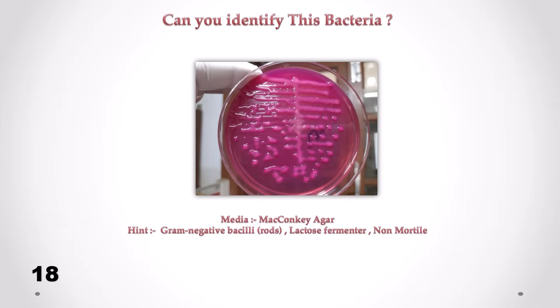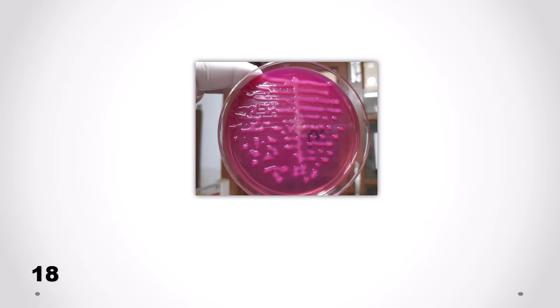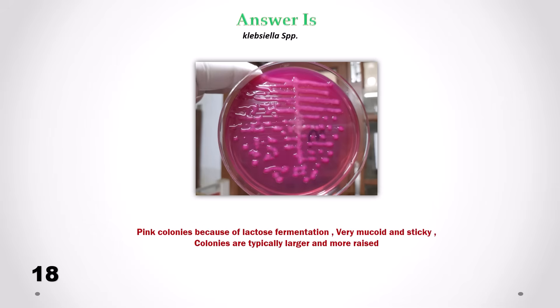Can you identify this bacteria? Correct answer is Klebsiella. We can see pink colonies because of lactose fermentation, very mucoid and sticky. Colonies are typically larger and more raised.